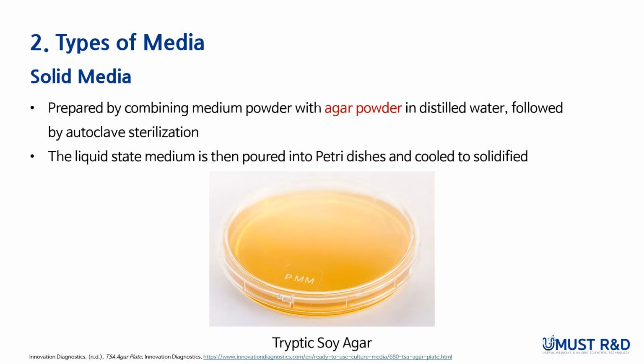Solid media are prepared by adding agar to liquid media, followed by autoclave sterilization. The media are then poured into petri dishes and solidified. Solid media are useful for observing and isolating microbial colonies. A representative solid medium is TSA, tryptic soy agar.